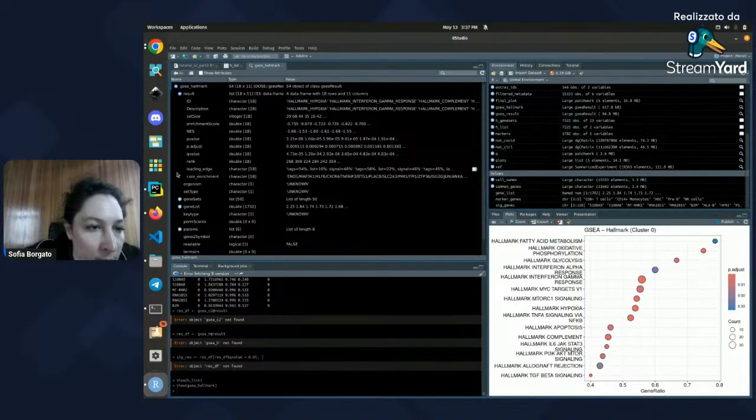What is also important here is that you have the core enrichment, so a list of genes that you found really expressed in your cluster. This is important because in some cases, maybe you found an enrichment for a gene set, for example this one, in more than one cluster. So in this case, you can go to the core enrichment and check if the genes are the same or different, and measure their power to be marker genes.